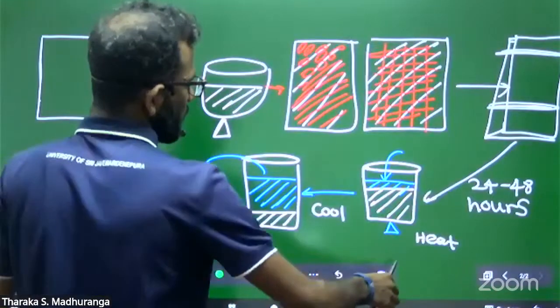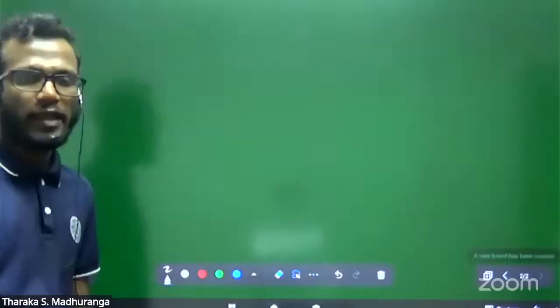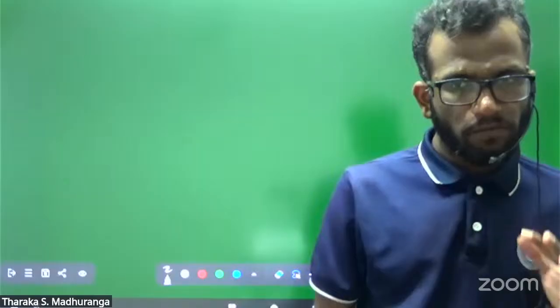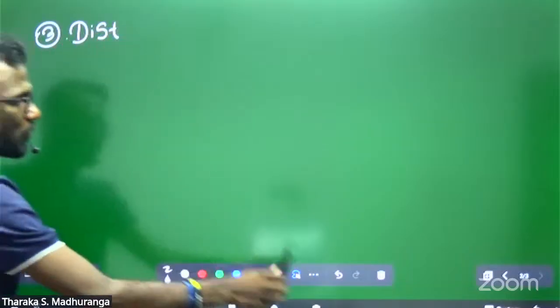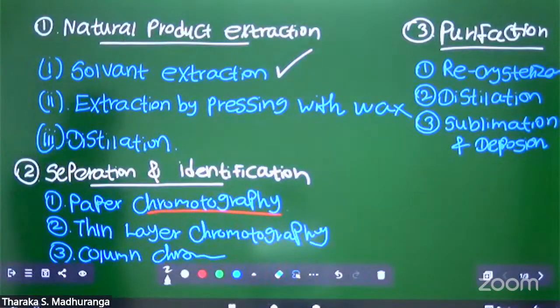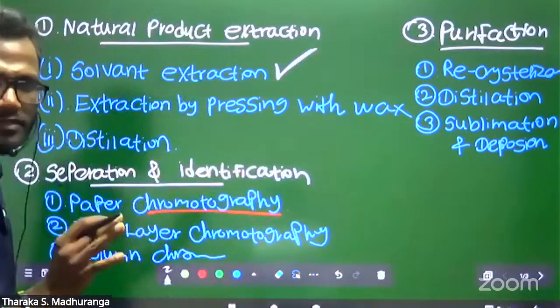Okay. Come to the third extraction method, a very important method. The third extraction method is distillation. Distillation, as I told earlier. Do you remember? The solvent extraction we discussed with practicals now.